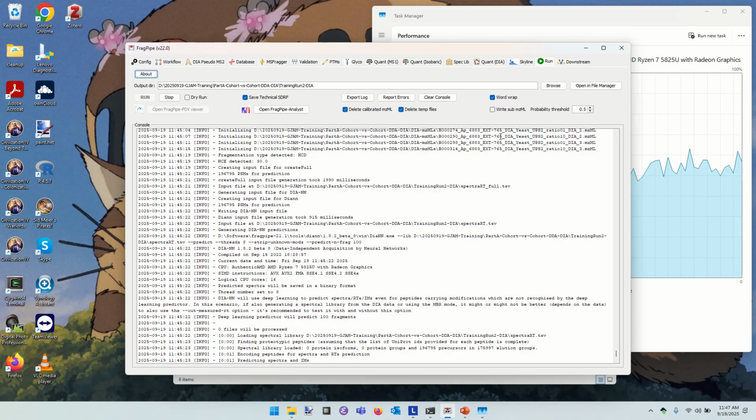Okay. The spectrum will be happy if you have 3. Yeah, this is why I'm asking, because I see that now the minimum required number is getting lower and lower. Okay, so does everyone understand what this question's about? All right, I have a peptide showing up and then fading away in kind of a log normal shape, I guess. If I have 3 measurements of intensity within those 30 seconds, what is my ability to quantify it? What is my ability to make an integration of that shape that bears any relationship to reality? Poor. Yeah, very, very poor.